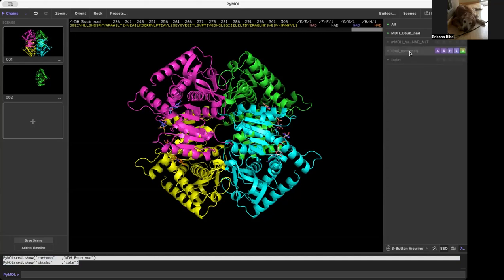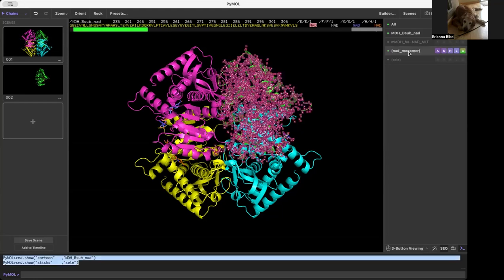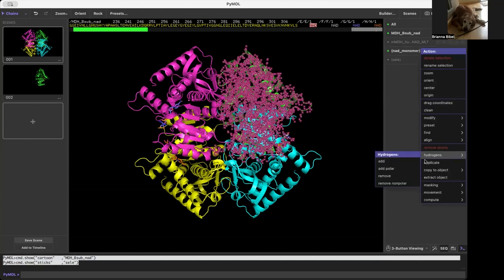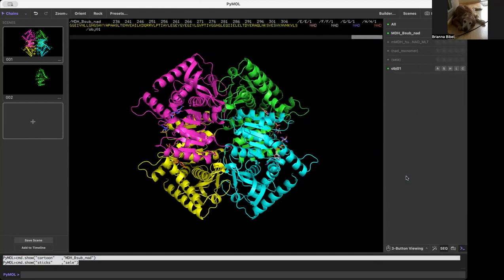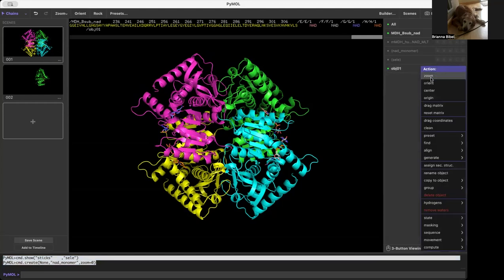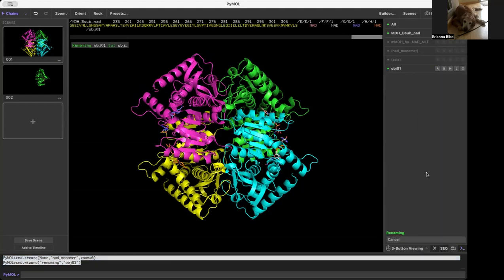Say I want to easily be able to go back to just this NAD monomer. What I can do instead of just making it a selection is go to Action, Copy to Object, and make a new object. It's going to make this new object. I can rename this object — Action, Rename Object — and I'm going to name this NAD monomer obj.